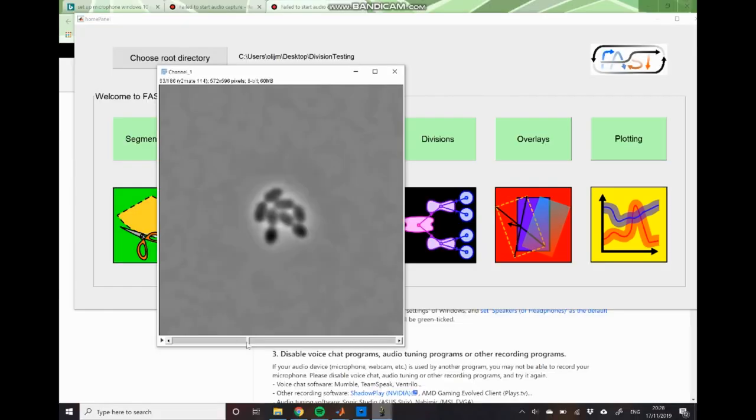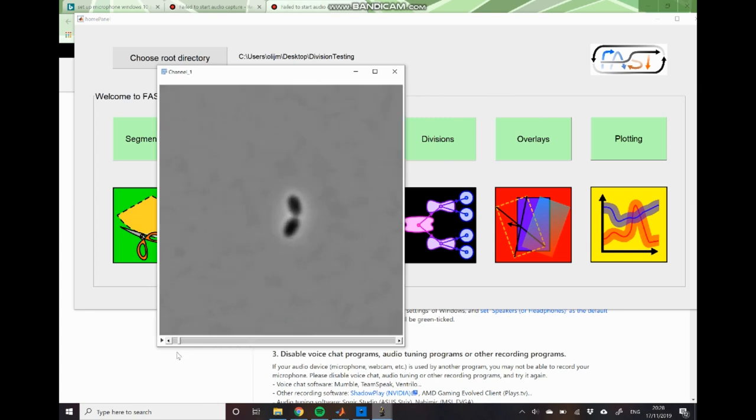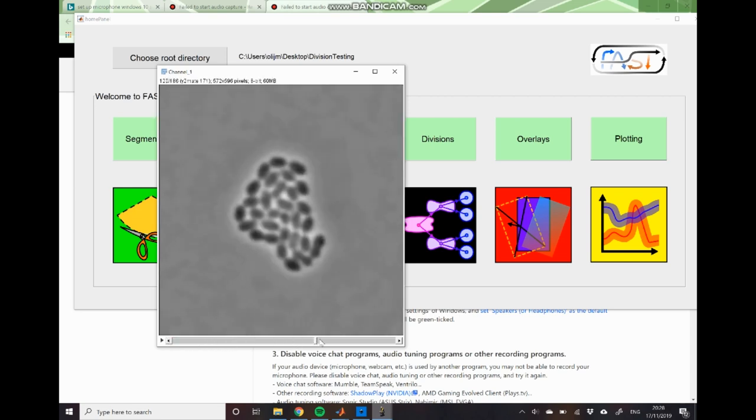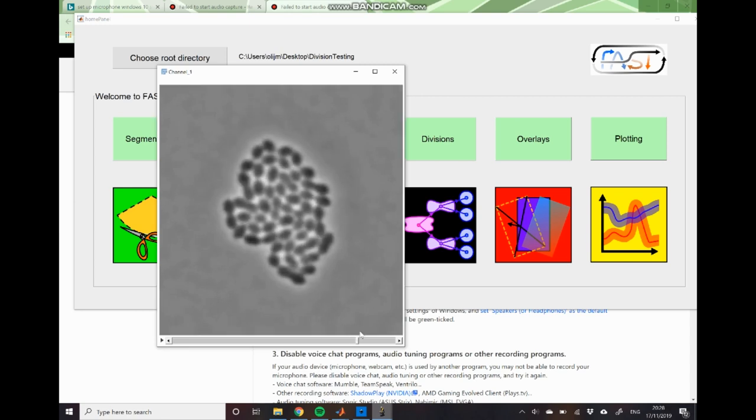In today's video we're going to be using a data set which is the same as we were using in the previous video which was track correction and validation. So in this data set you can see that we have these two bacterial cells that undergo repeated division events and end up generating this large microcolony.